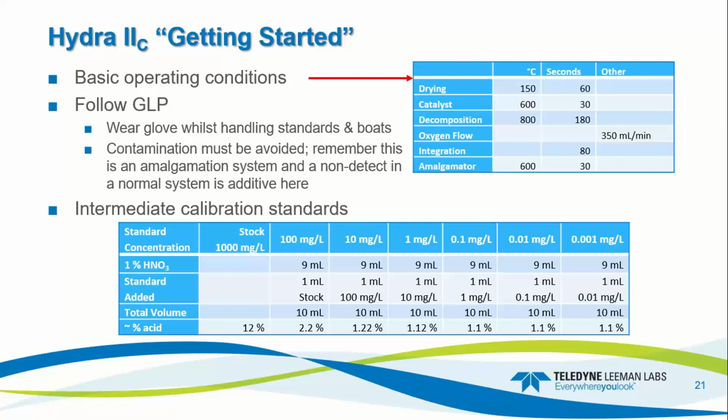You need to follow really good GLP. So while you're making standards and handling boats and so forth, because this is a collection system, any contamination that's in and around the area is going to get collected on that gold trap, so it's all additive.